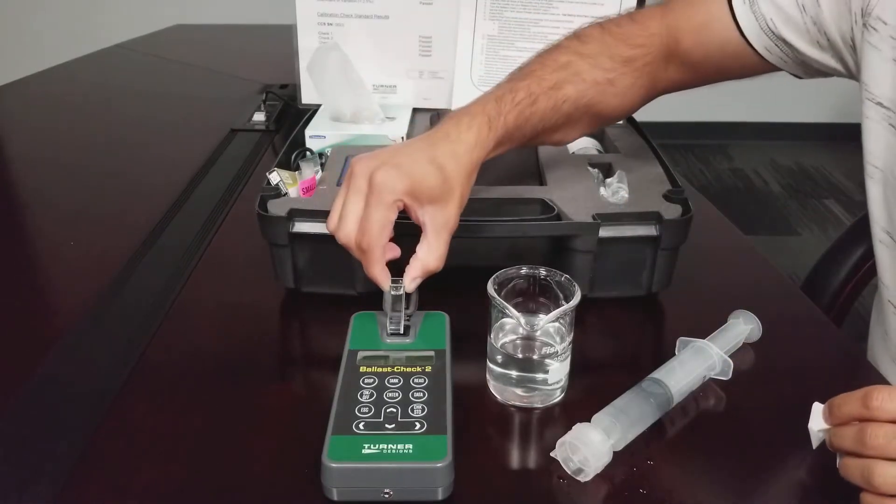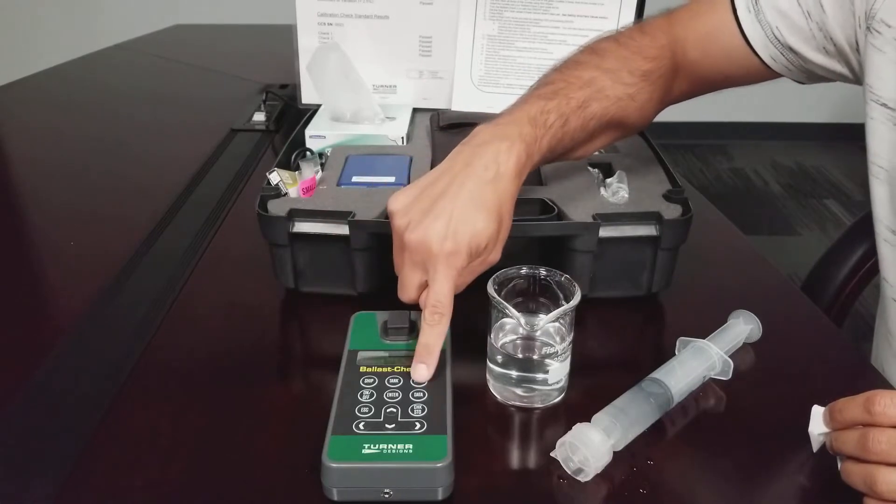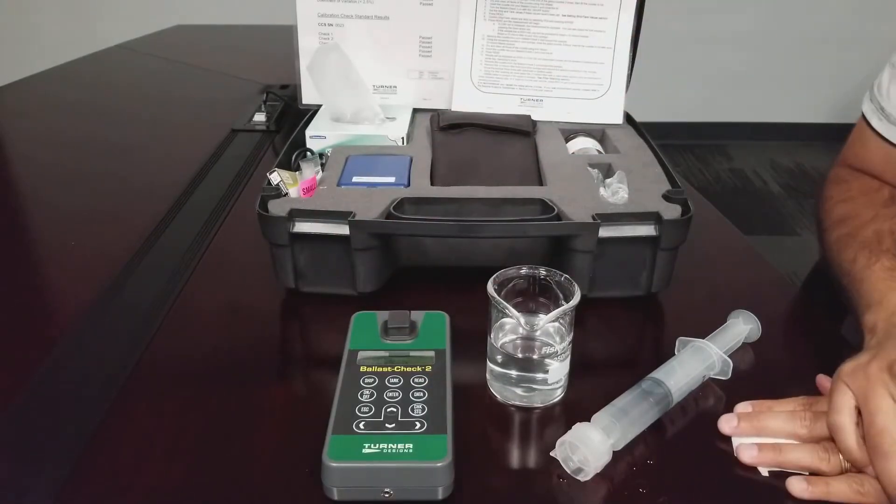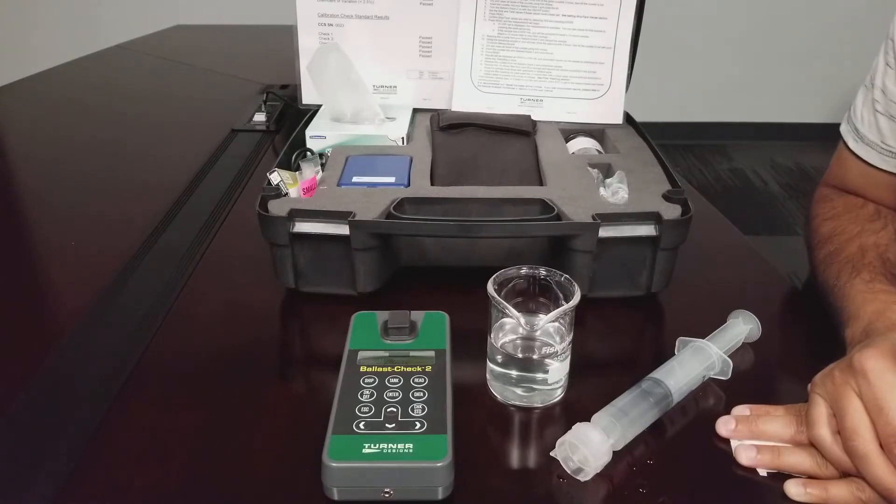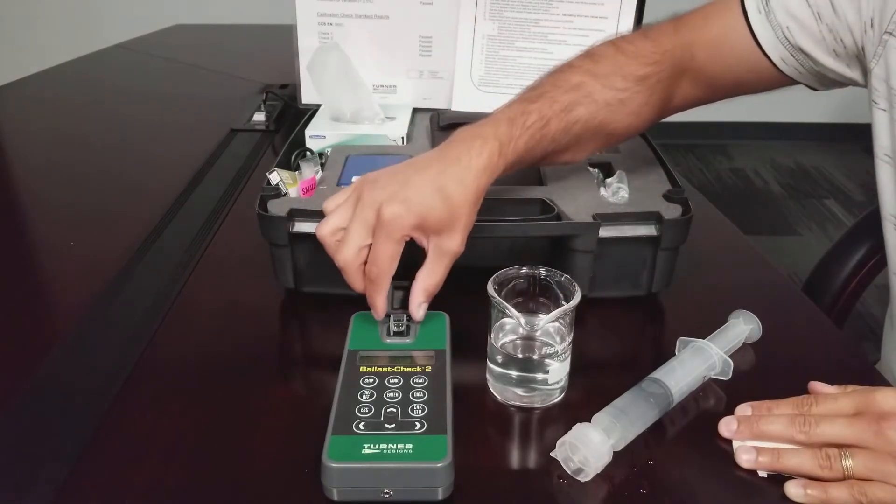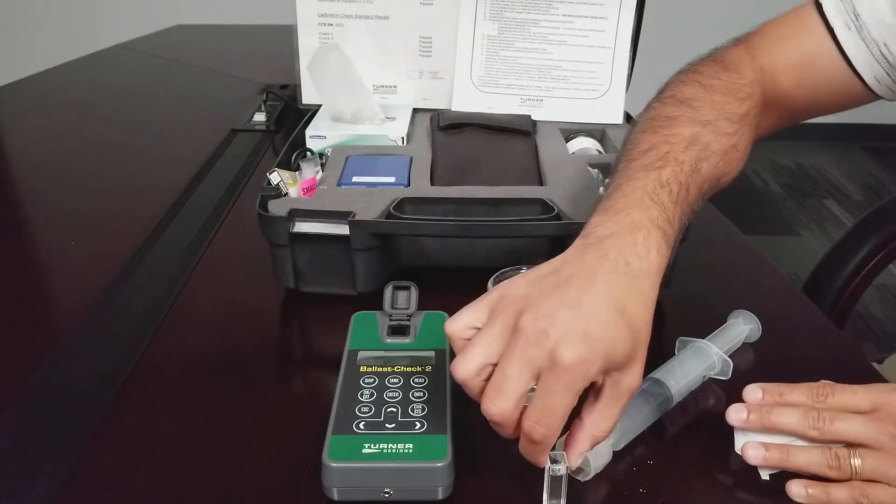Insert the cuvette into the sample compartment, close the lid, and press read. Wait for the measurement to complete. Then remove the cuvette from the sample compartment.